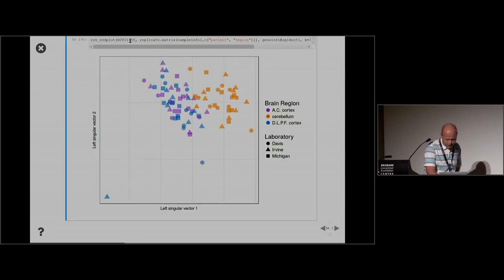Okay, so very good. Here, for example, in the RUV3 function that does this analysis, there's this variable k here, which goes off the screen, but it's actually equal to 10. So what actually happens in here is the factor analysis is done just by a singular value decomposition, and k equals 10 says take the first 10 factors.